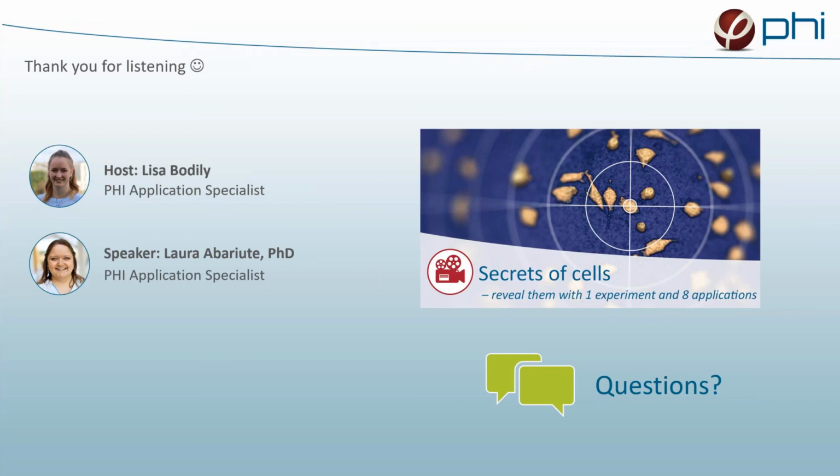Got another one here from Daniel from the UK. He's asking, what about U2OS, which is a cell line I just looked up, which is a human bone osteosarcoma epithelial cell line. And his question is, can he work with that cell line? Yes, absolutely. All of the adherent monolayer cells are perfectly suited for HoloMonitor M4, as well as all the primary and stem cells, as it is a gentle, non-invasive, and non-toxic method. So you can image all the sensitive cells as well as the cell lines.